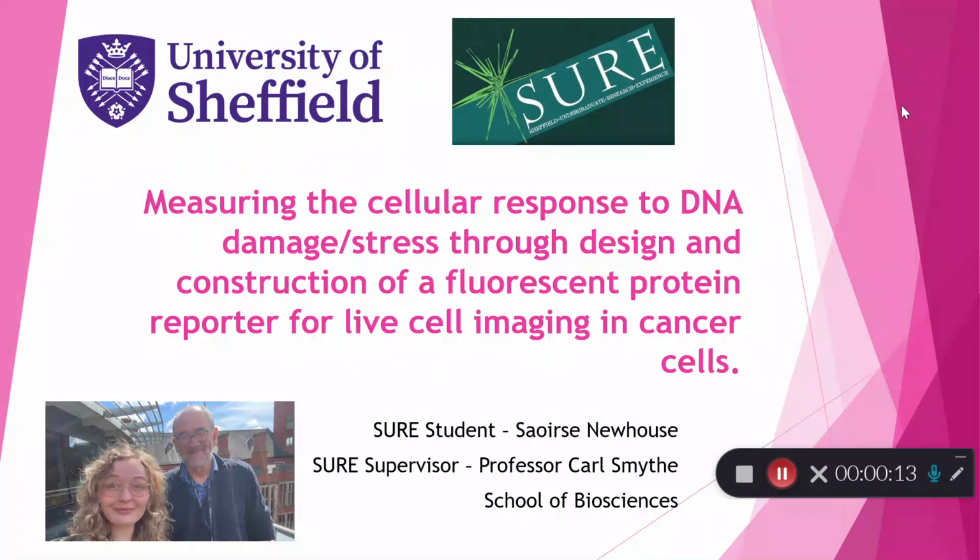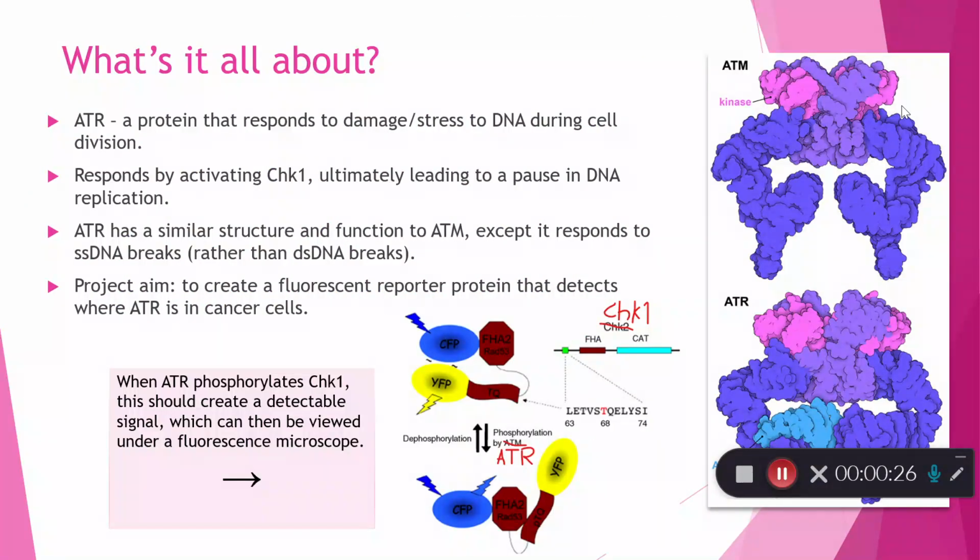So my project was measuring the cellular response to DNA damage or stress through the design and construction of a fluorescent protein reporter for live cell imaging in cancer cells. So first I'll explain a bit about what my project was about.